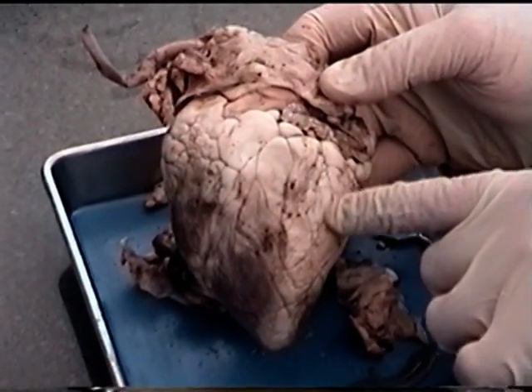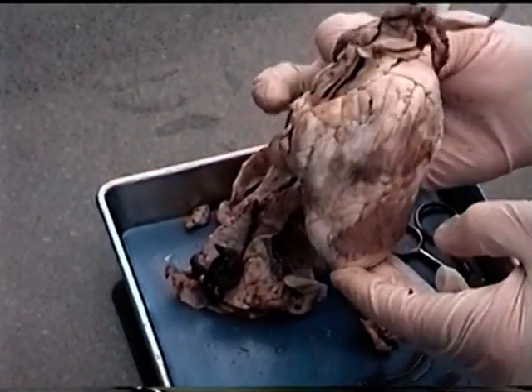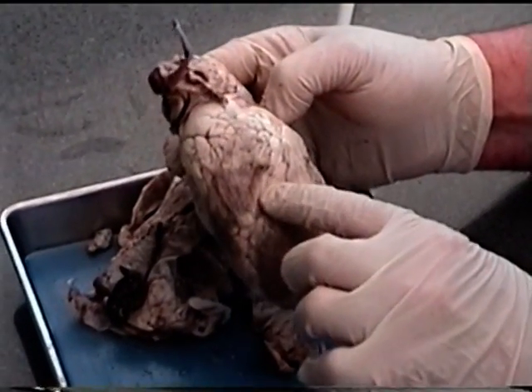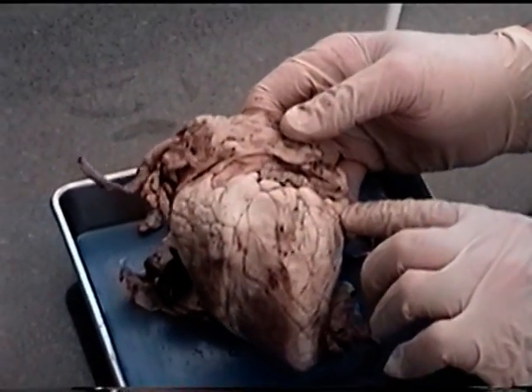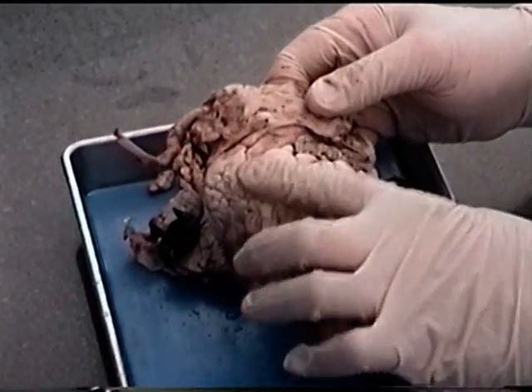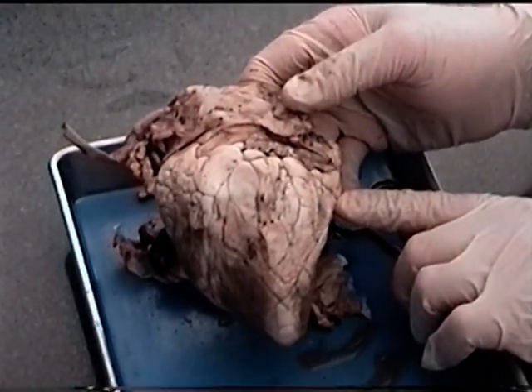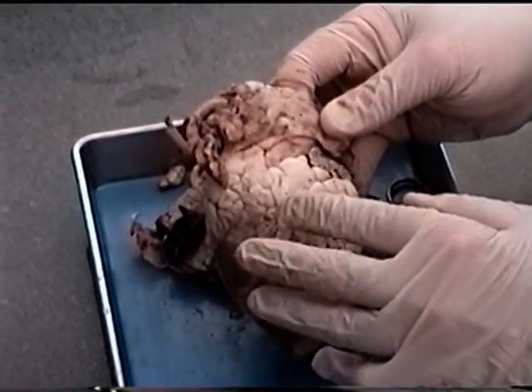And so are major blood vessels that we're seeing in the anterior interventricular sulcus. So we rotate it around, it communicates with the posterior interventricular sulcus. And the fat we're seeing going around this part of the heart here and around this part of the heart here is actually sitting in that coronary sulcus that we talked about that would have major blood vessels in it. So once we know that, then we've got a good orientation of our heart.